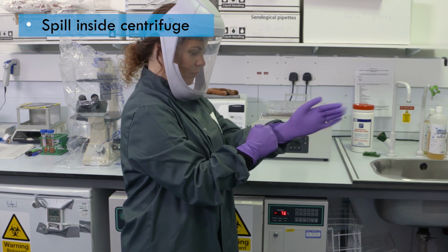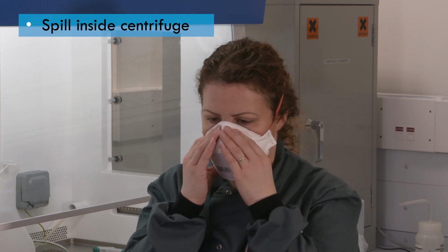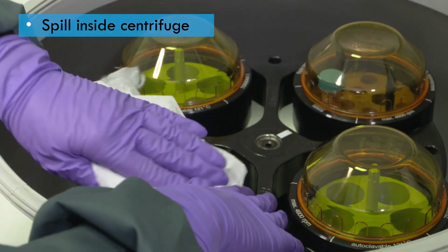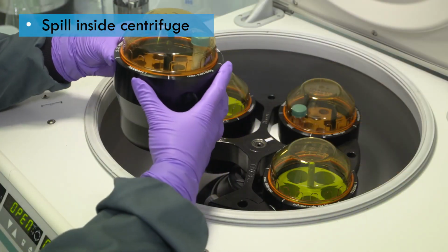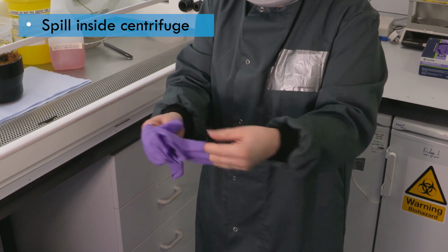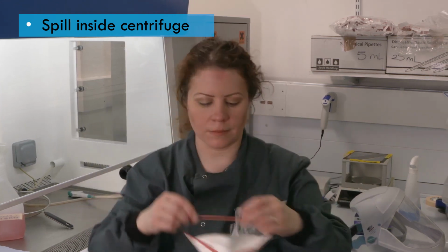If the buckets or rotor do appear to be damaged, or you can't see inside the lid, then respiratory protection should also be worn in case there is a regeneration of aerosols from the spilled liquid when you open the lid. Carry out surface decontamination of the sealed bucket or rotor in situ before transferring it to the nearest biosafety cabinet. The eye and respiratory protection can now be removed, as the biosafety cabinet will contain any further aerosols or spills.